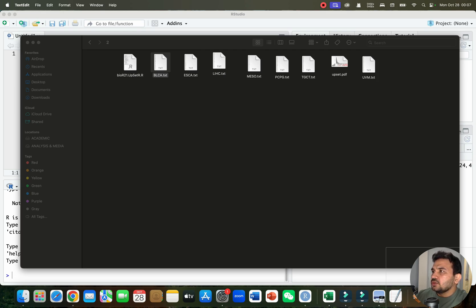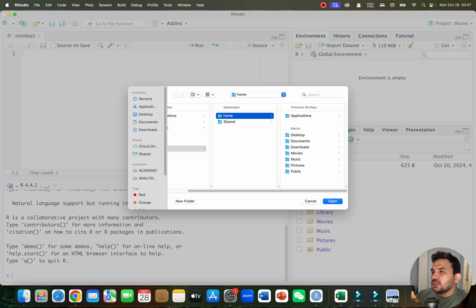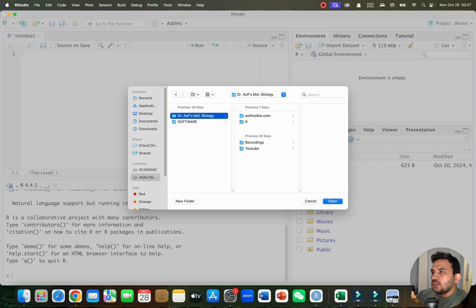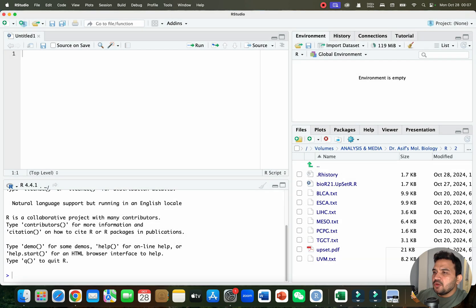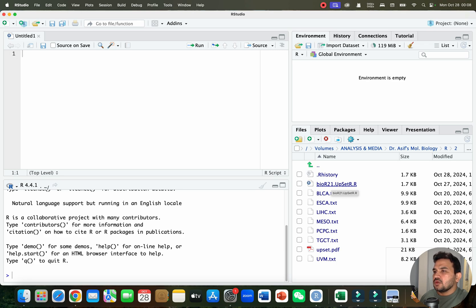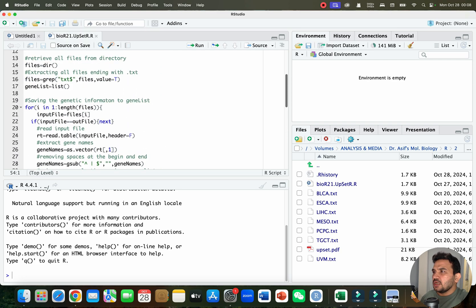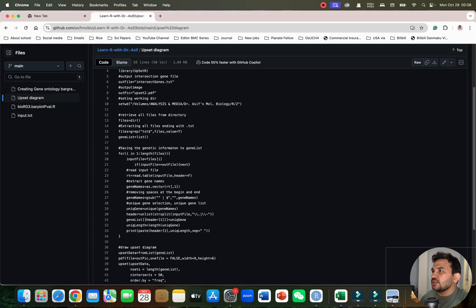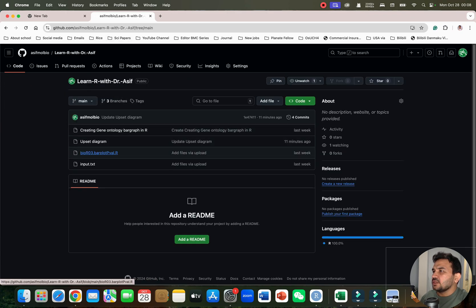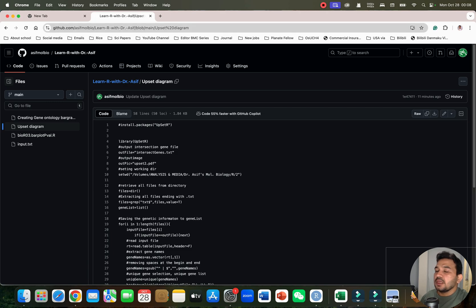Let me go to R and show you this folder. Here is R and here is folder number two, which I will open. I have already written an R script. If you want this R script, I have already uploaded it to my GitHub page of Dr. Asif Molecular Biology. You can go to this page and find the R script — I will also paste the link in the video description. You can even ask ChatGPT to help you write the code.